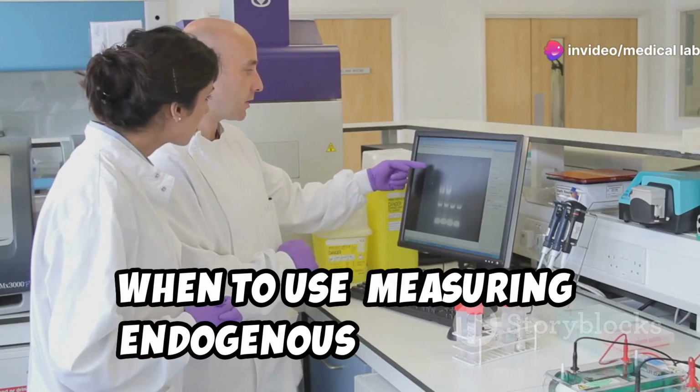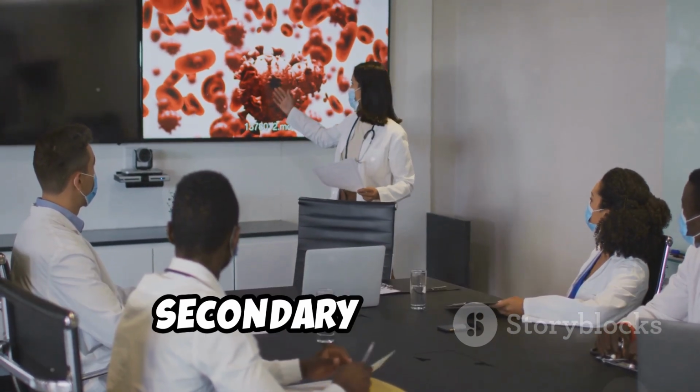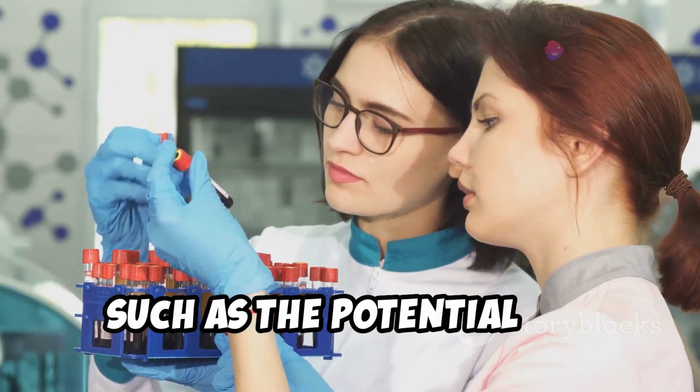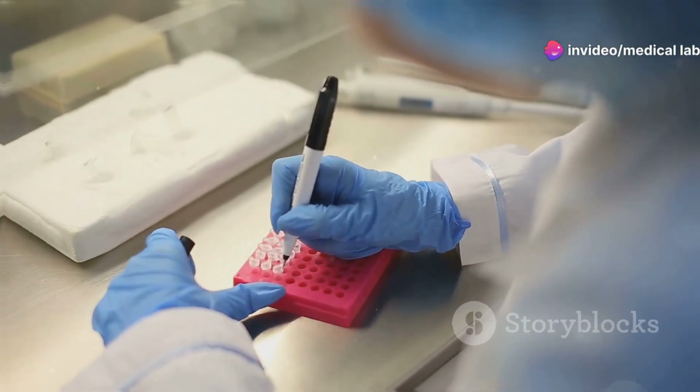When to use: measuring endogenous antibodies. Advantages include amplification using a secondary antibody. However, there are disadvantages, such as the potential for cross-reactivity caused by the secondary antibody.